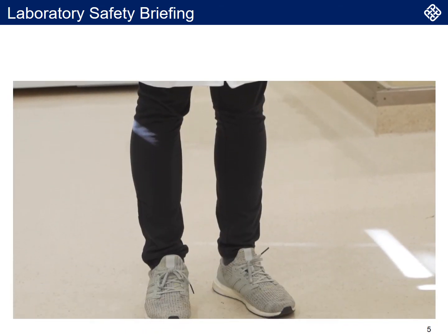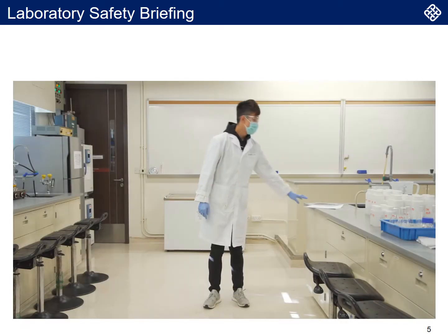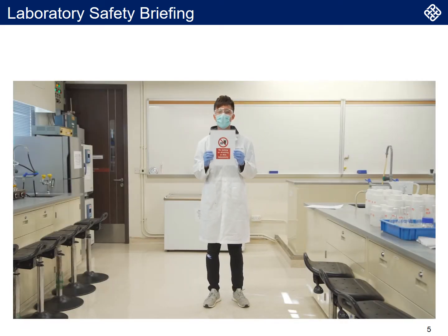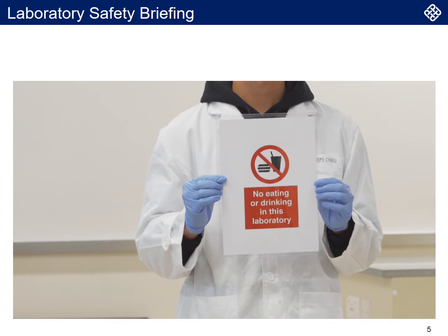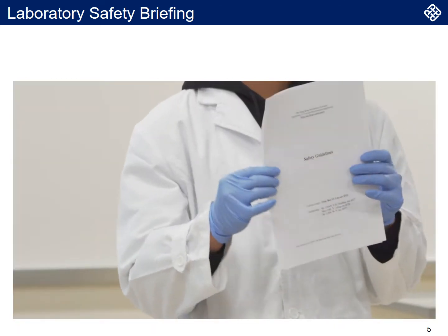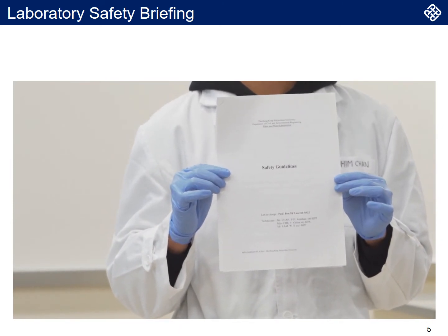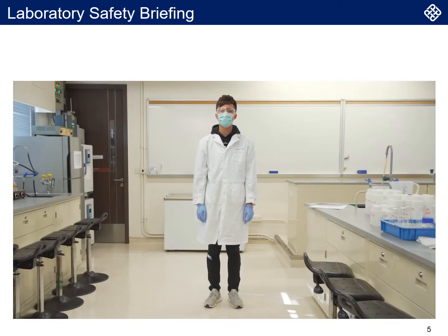Thirdly, please wear fully covered shoes to protect your feet. Fourthly, no eating or drinking is allowed in our laboratories. Please also read the safety guidelines before working in the laboratory. If you have any questions during the experiments, please do not hesitate to ask our technical staff.